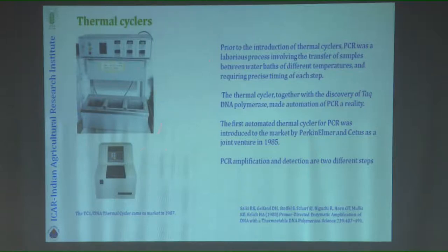I'm just showing you a couple of pictures to appreciate how the PCR machine has evolved. If you look at the PCR machine in 1983, you will see they had a few incubators, like water baths, at different temperatures. One had to take the sample and put it in the other one, then do all the reaction. This was not automated in the beginning.